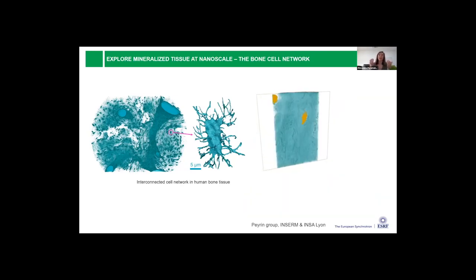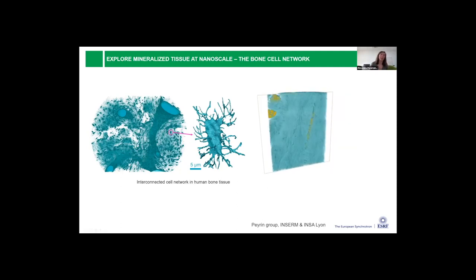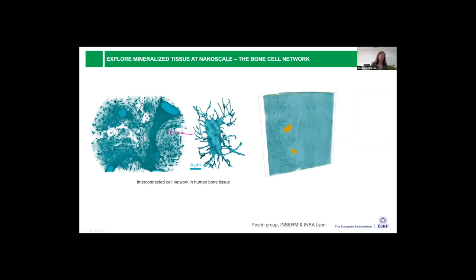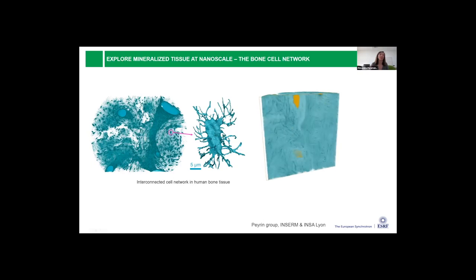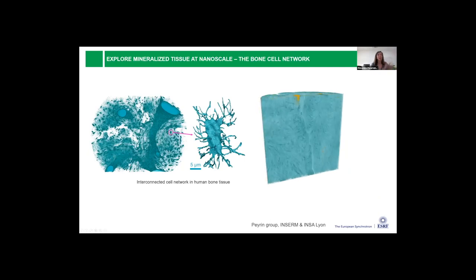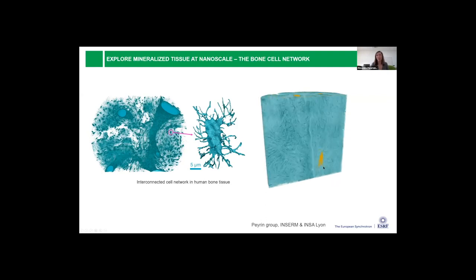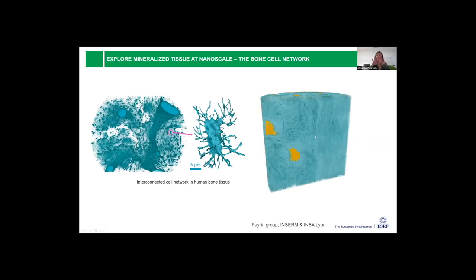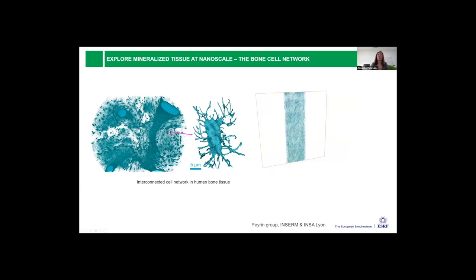For example, if you go for a run, your bones may develop small defects. So you see here about 300 microns of bone tissue, where there are many cells organized in cylindrical multi-layered structures, and here are blood vessels and nerves that come in this hole. So what is around here is hard mineralized tissue, which you can see in the image on the right. Here you see in orange the cells, and the structured tissue around is made of hydroxylapatite crystals combined with collagen fibers.